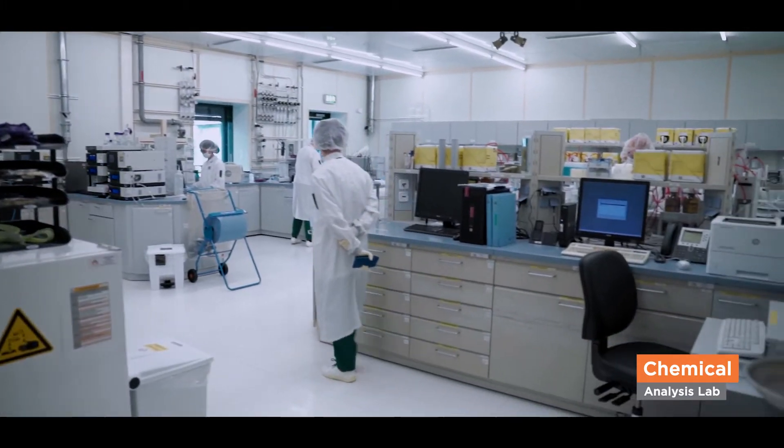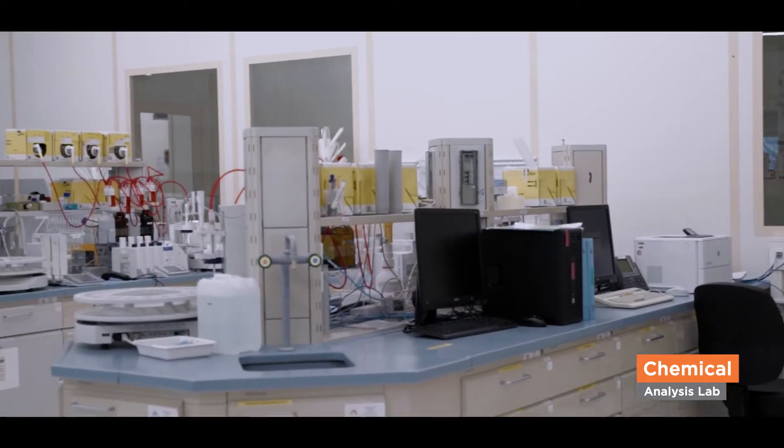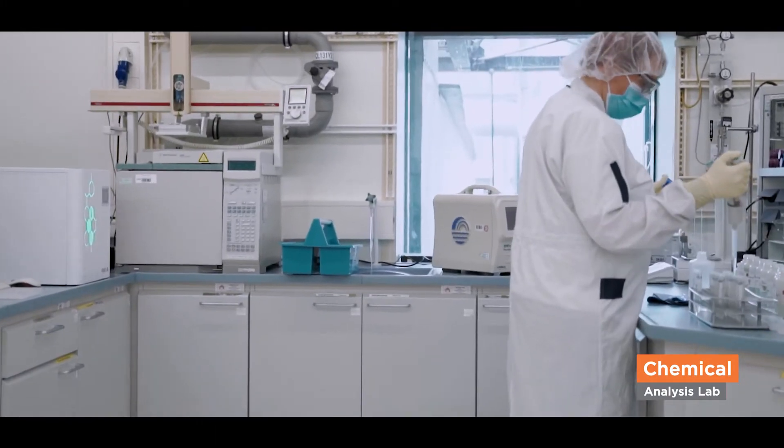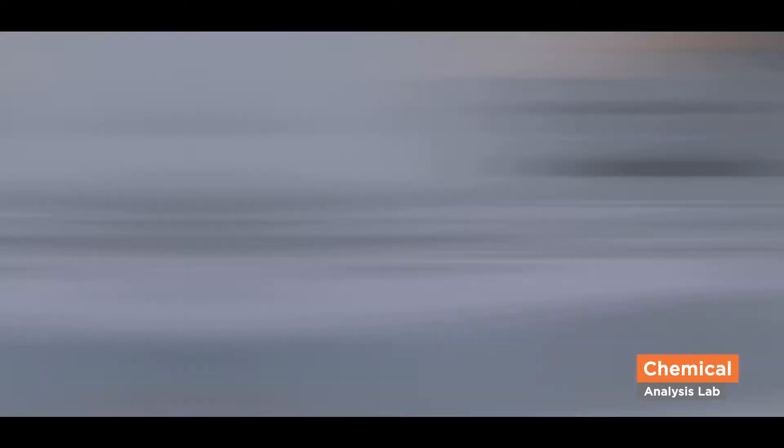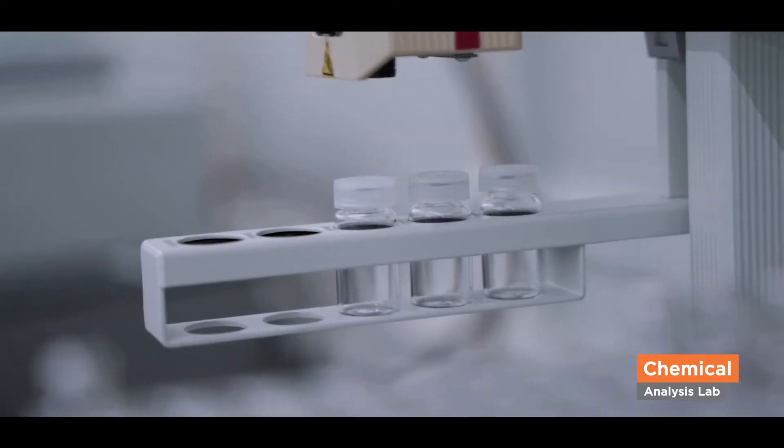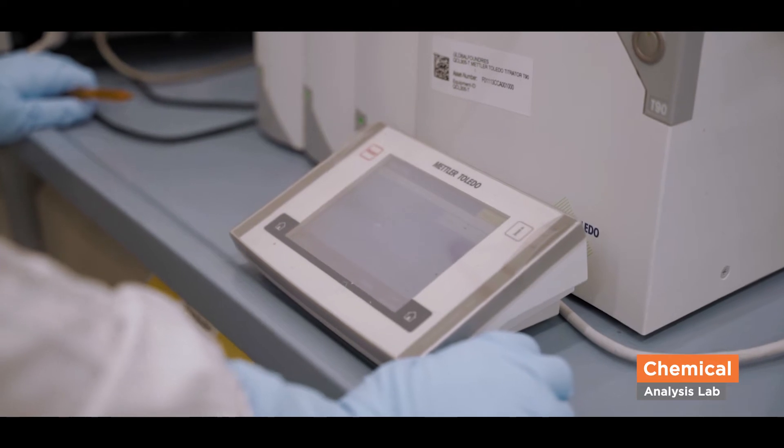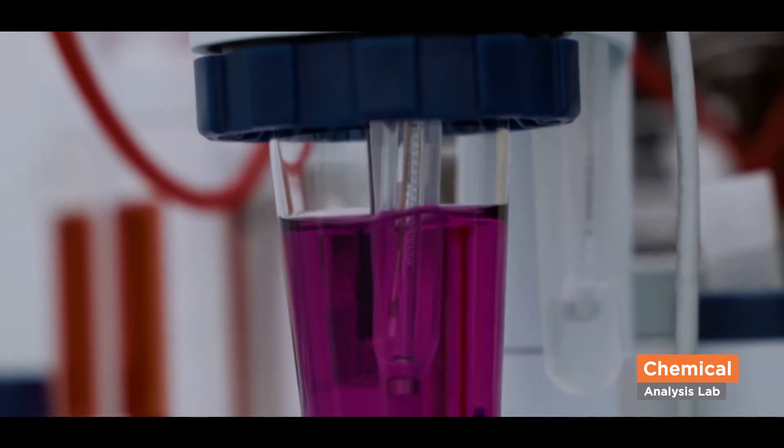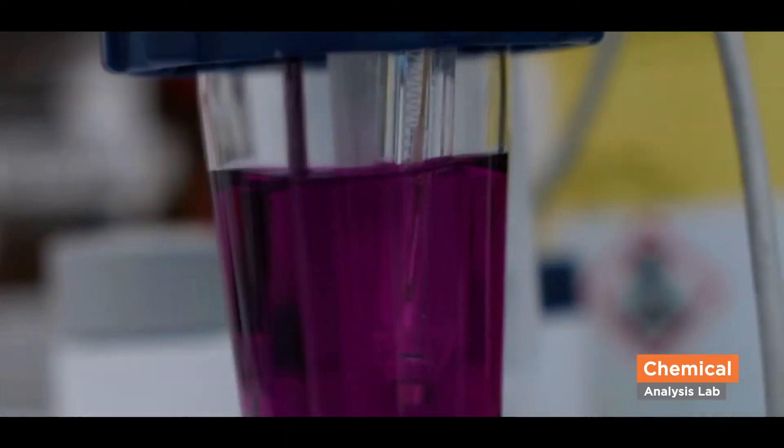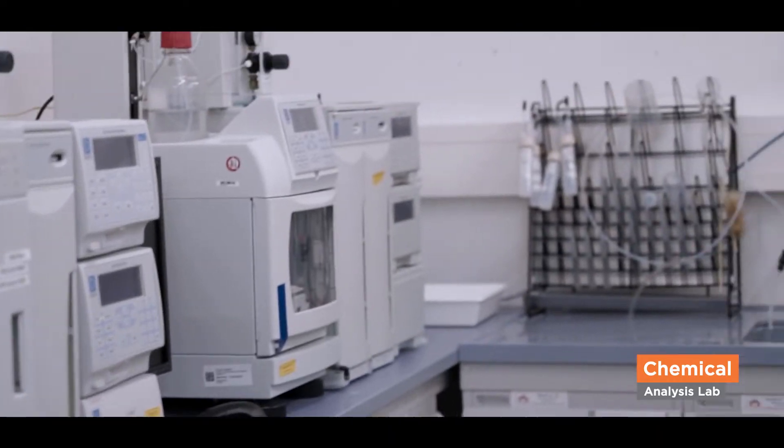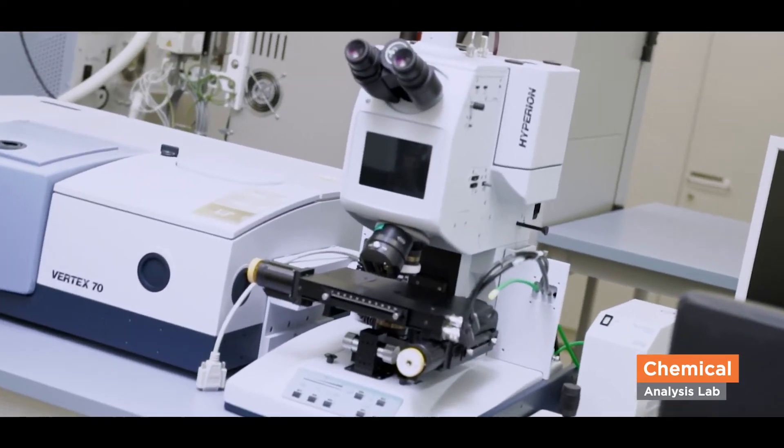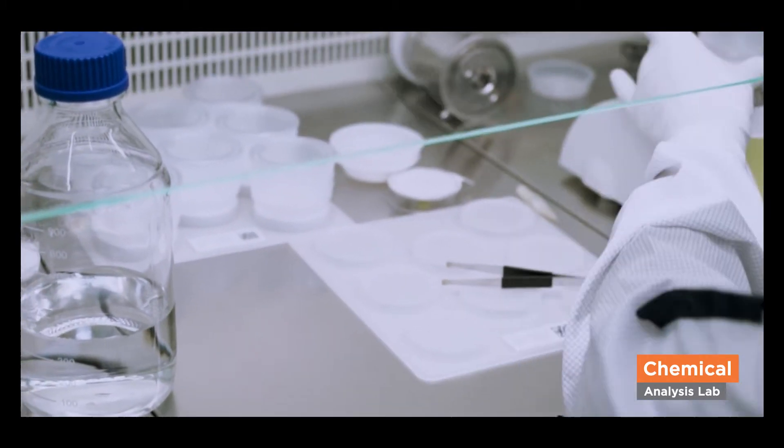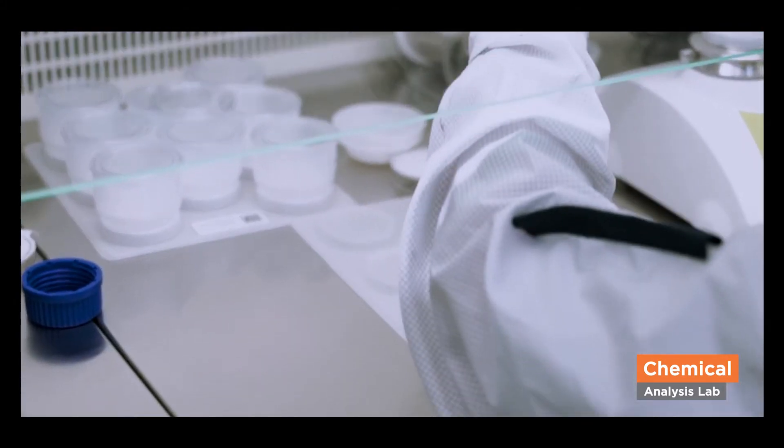Another task in the chem lab is the determination of assay of the process chemicals and the composition of process mixtures, like cleaning and electroplating baths. Here, among other things, the assay determination of hydrogen peroxide is shown. In addition, many other analytical techniques are used to support the production process, which plays an important role to assess the quality of our ultra-pure water and of certain chemicals.